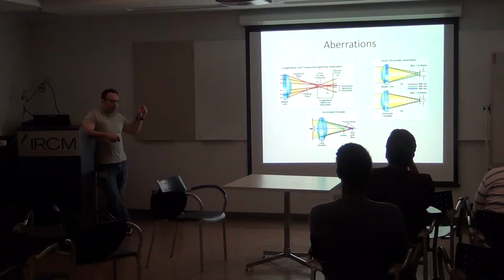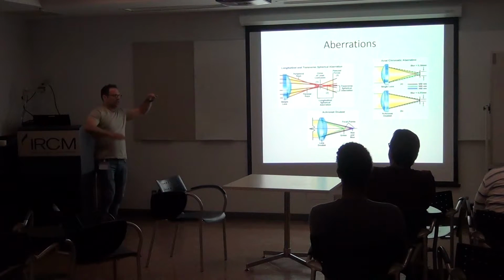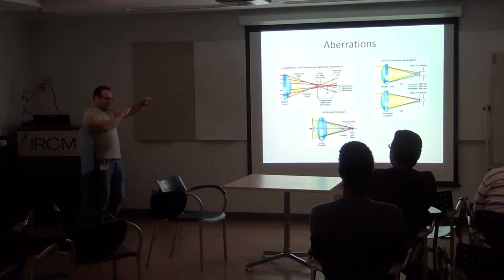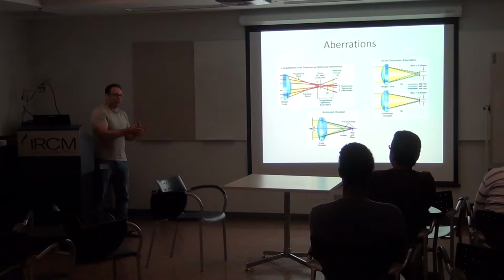And this is why an objective in microscopy has a fixed focal length, and the design of this lens is made of glass which, at this particular position, will limit the aberration. So they made this lens to limit the chromatic and spherical aberration.